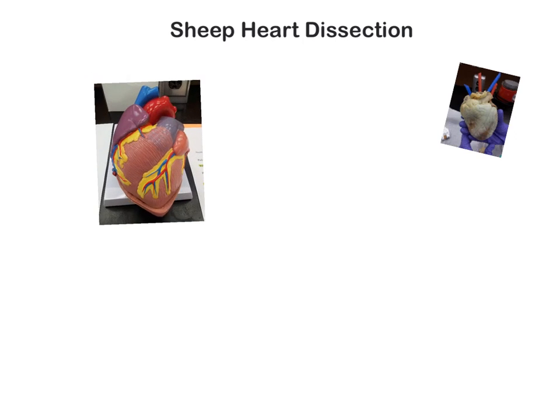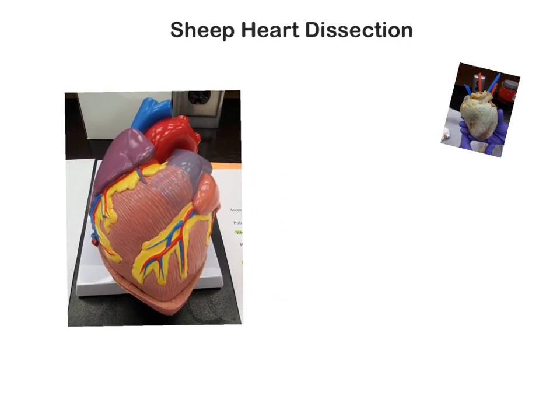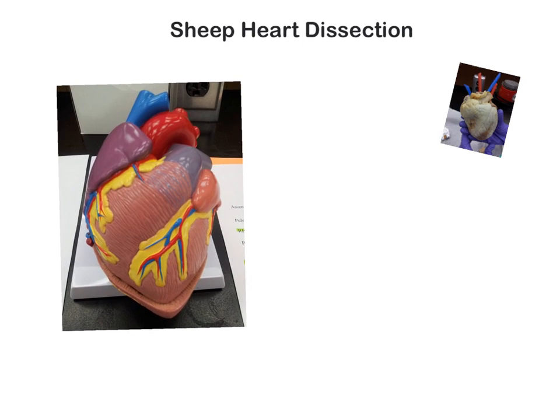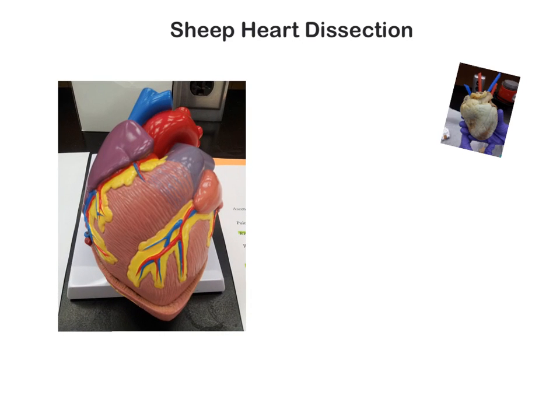The first thing to determine when looking at the sheep heart is which is the anterior surface or the ventral, and which is the posterior or the dorsal surface. If we take a look at the model, we can see that there is a prominent coronary artery going at an angle, and this is the anterior interventricular branch of the left coronary artery.